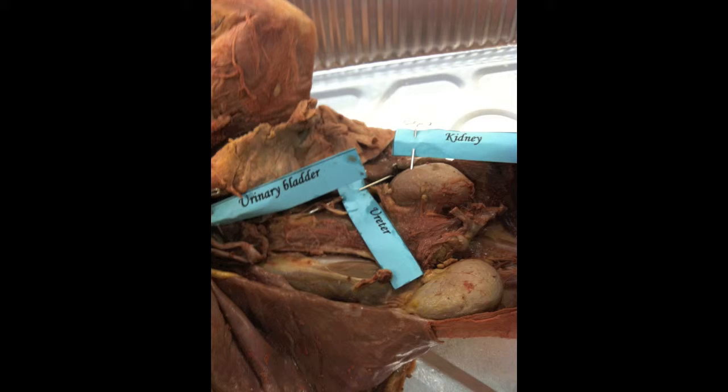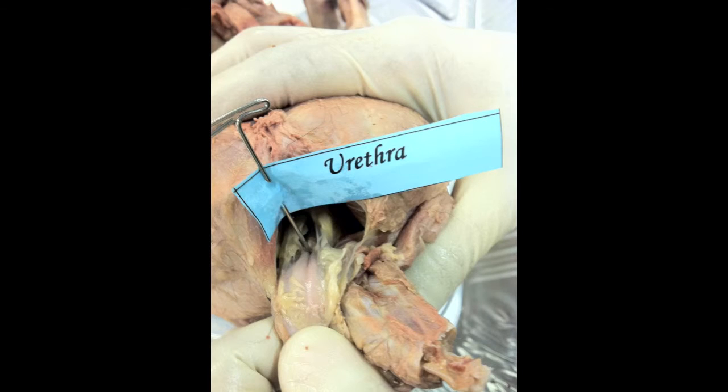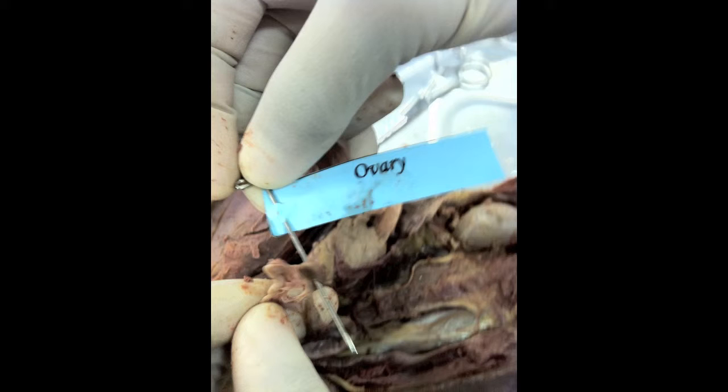The urinary bladder receives urine from the ureters and stores it until it is released from the body. The urethra expels urine from the urinary bladder. The production of eggs and the regulation of female hormones takes place in the ovary.